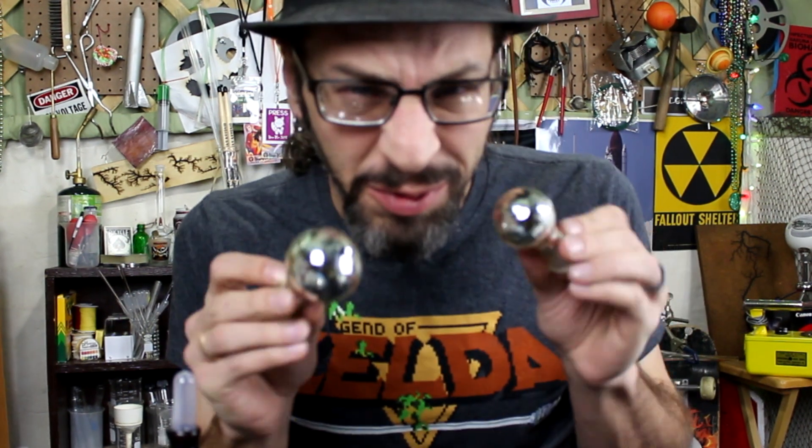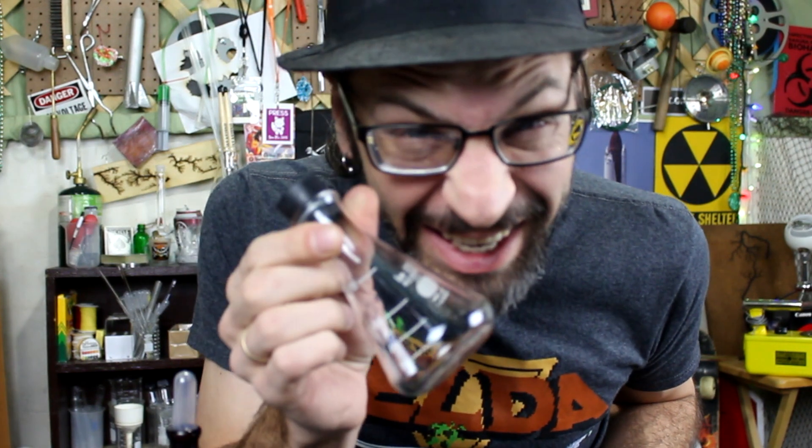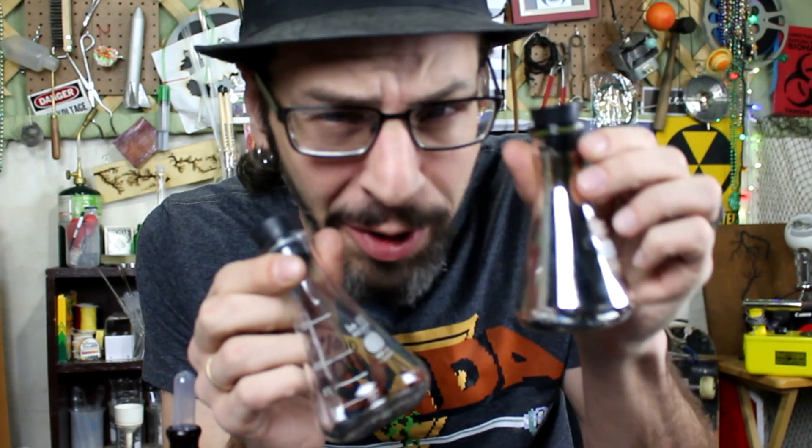So today I'm going to show you how they make those cool Christmas ornament balls, but we're going to do it with flasks. Basically, I'm going to show you how to turn something like this into... Oh yeah.